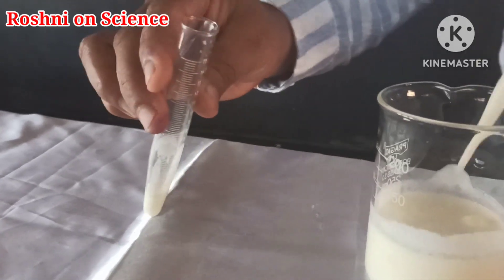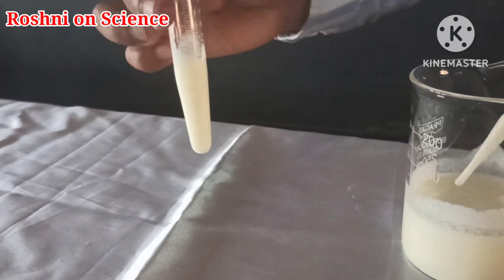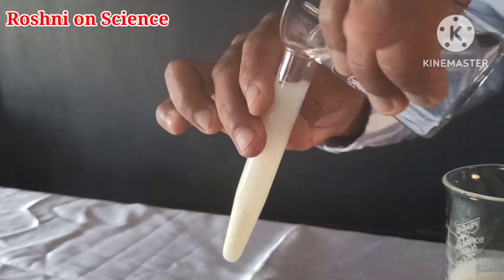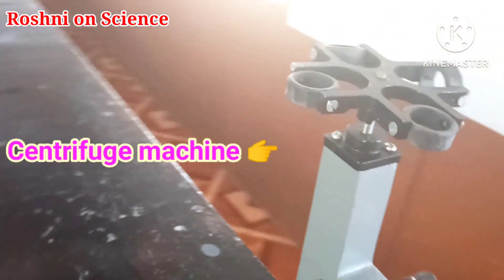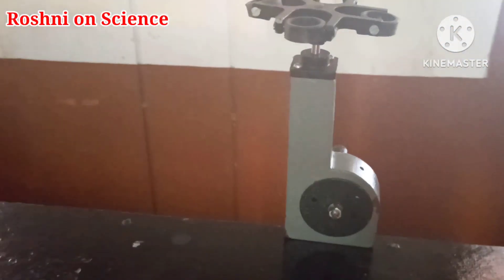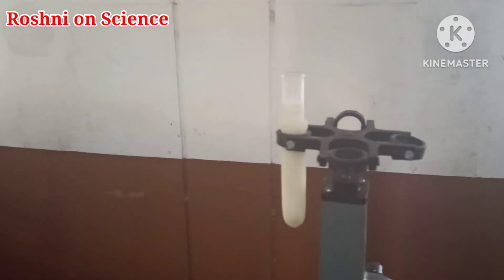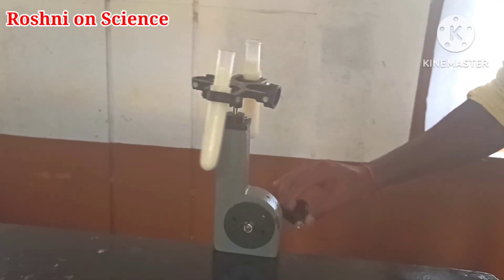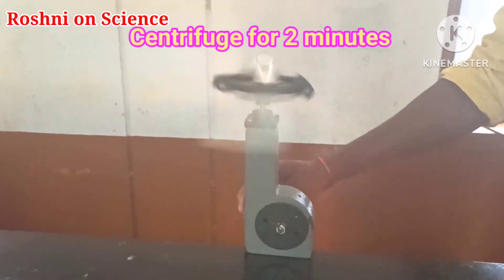Fill half a test tube with curd and add water to the test tube. Fix the test tubes to the centrifuge machine. Centrifuge it using a centrifuging machine for two minutes.